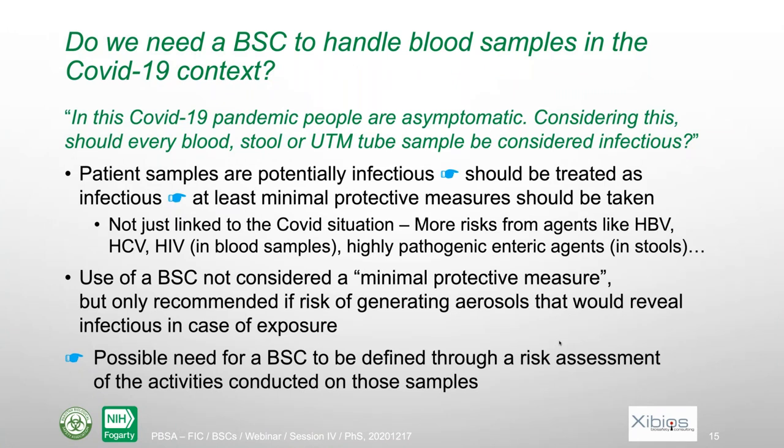Also, a specific question in relation to the COVID context: do we need a biosafety cabinet to handle blood samples, for instance, and other types of samples? The question comes from the fact that many people might be infected by the coronavirus but are asymptomatic. That means that the samples could contain some coronavirus. What we need to consider is that all samples are potentially infectious, but not only with coronavirus.